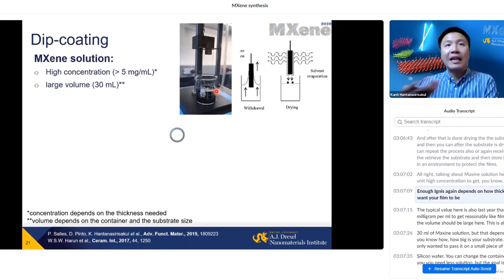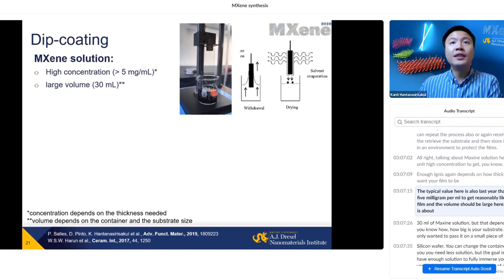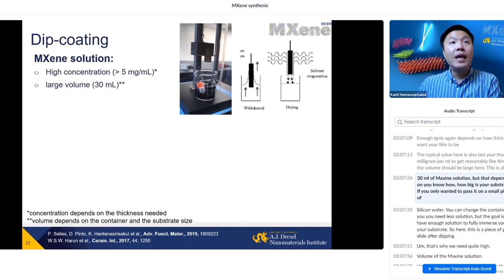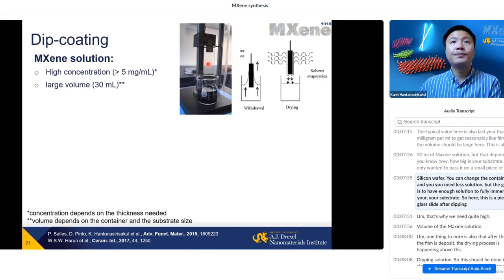Here, you need high concentration to get enough thickness. Again, depends on how thick you want your film to be. The typical value here is also larger than 5 mg/mL to get a reasonably thick film. And the volume should be large. Here, this is about 30 mL of MXene solution. But that depends on how big is your substrate. If you only want to deposit on a small piece of silicon wafer, you can change the container and you need less solution. But the goal is to have enough solution to fully immerse your substrate.